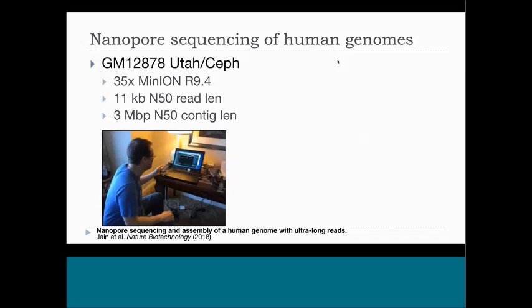And among the groups that were involved, we collected over the course of a month or so 35x coverage of this genome with an 11 KB N50 read length, resulting in a 3 megabase pair N50 contig length.